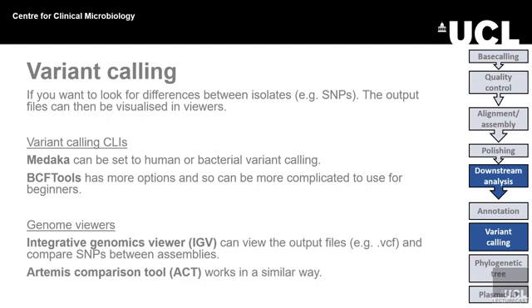I have actually put a link to a list of loads of different tools in the PDF. So as I say, you might find that whatever I'm saying doesn't necessarily fit exactly what you want. Have a look in that list and hopefully you'll be able to find one that is more appropriate.